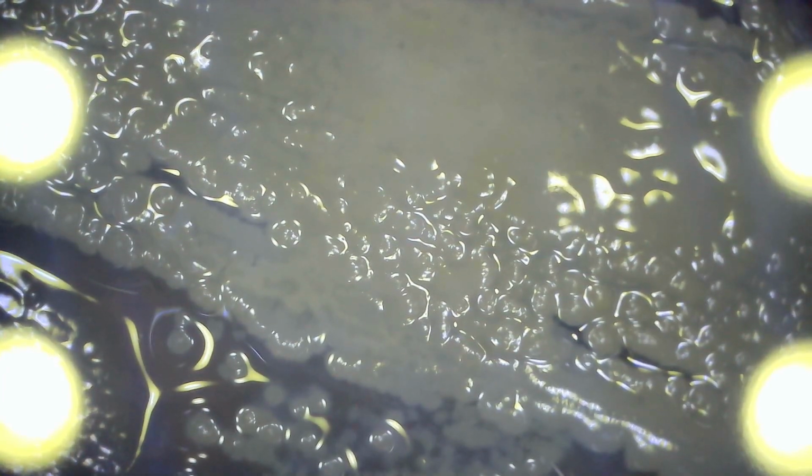What else we got? Let's look at this. The snotty stuff is less visually interesting, I feel. I think that's basically everything. This one over here has got a sort of brown fuzz to the edge of it, which is interesting. What else have we got? Let's see this. See if this is the same as the other fingered surface goo that we had before. So we can see a similar structure where this appears to be more filled in. There's less gaps between it.